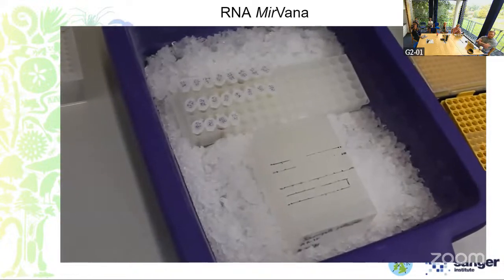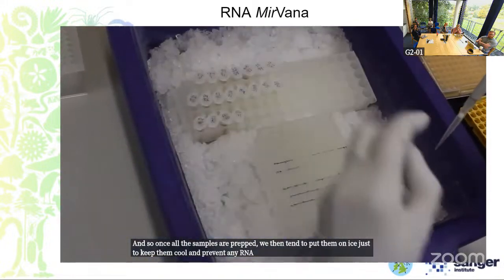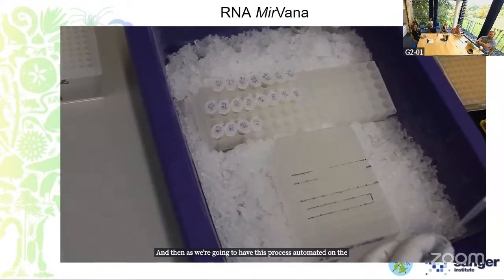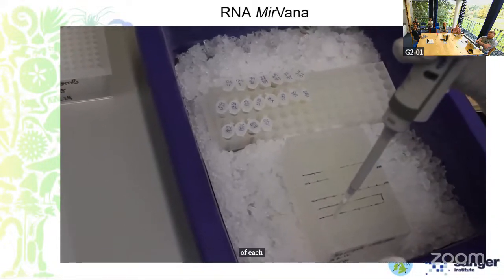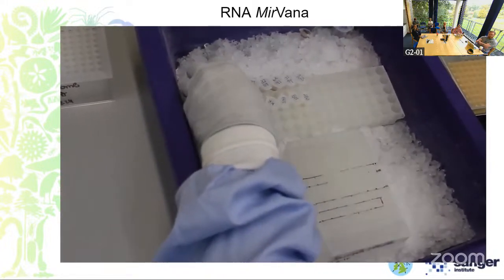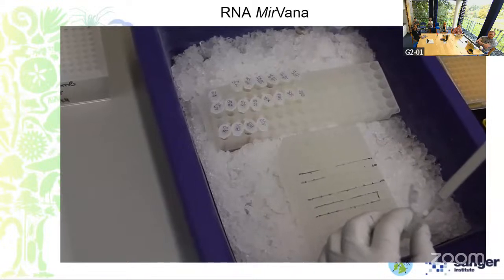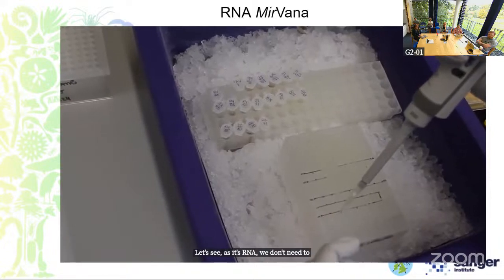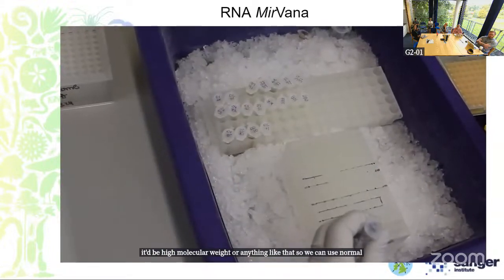And so once all the samples are prepped, we then tend to put them on ice just to keep them cool and prevent any RNA degradation. And then as we're going to have this process automated on the Kingfisher, we'll have a sample plate, and we'll take 200 microliters of each sample and put that into a well of the sample plate. As it's RNA, we don't need to worry too much about it being high molecular weight or anything like that, so we can use normal tips for this transfer into the plate.